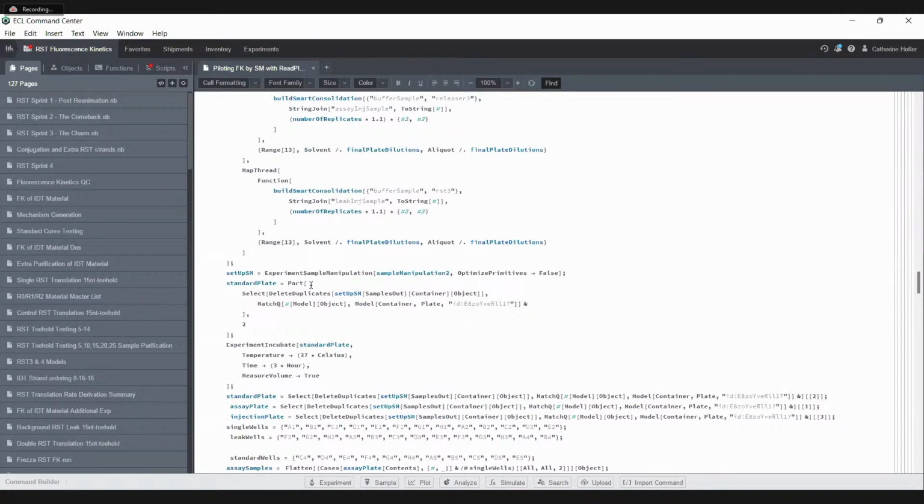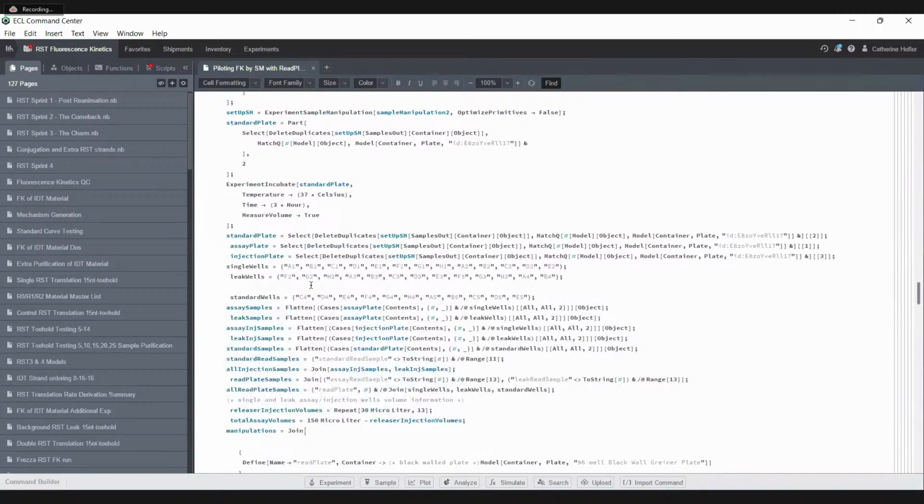Well, just think what you'd have to do if you didn't have Emerald to do it. Yeah, I'd have pages and pages of scratch notes and check marks after each one, so I make sure I'm pipetting into the right wells of every plate. How long would it take you? I'm just curious to get a sense of this. If you were doing this experiment by hand, how long would it actually take? Is this like a week long? A day? No, this is a relatively quick one.